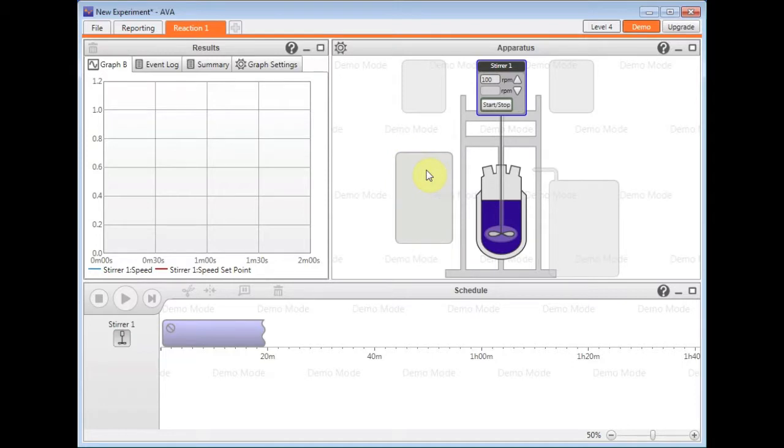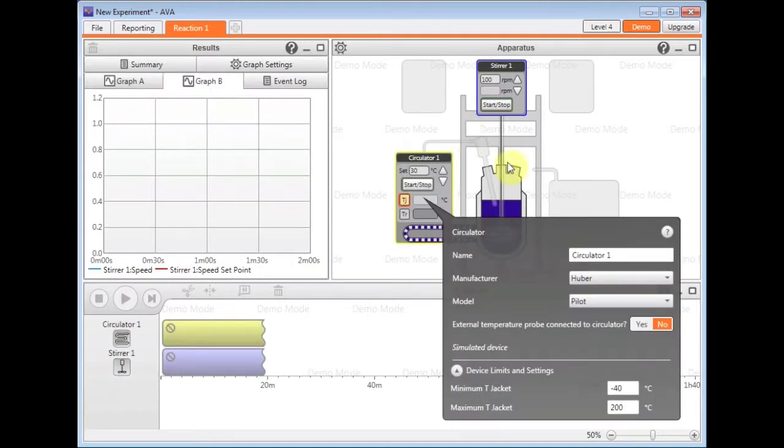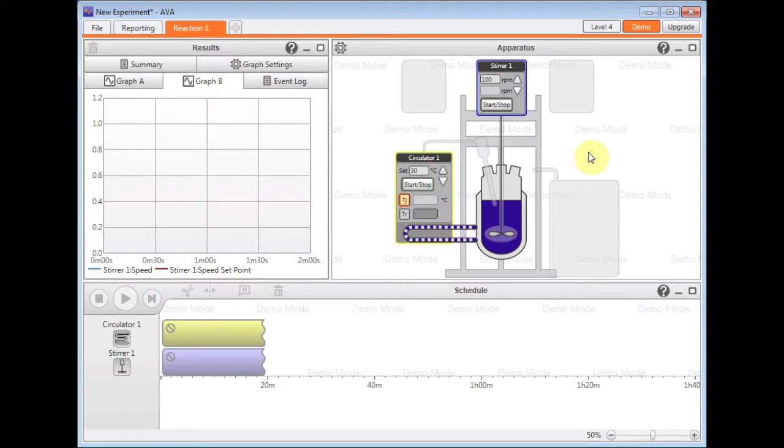This icon zone, or zone down the bottom here, is for circulators only. So if I click on there, I just get a circulator icon which I can choose. Again, click off to apply.